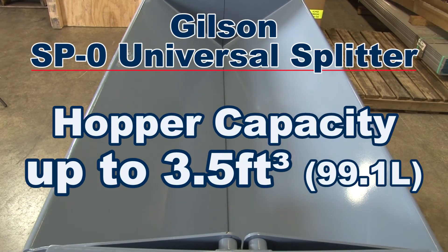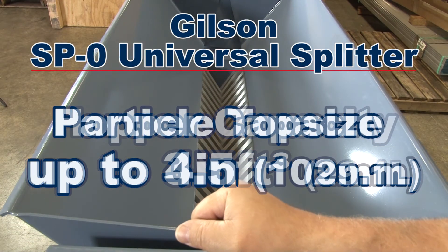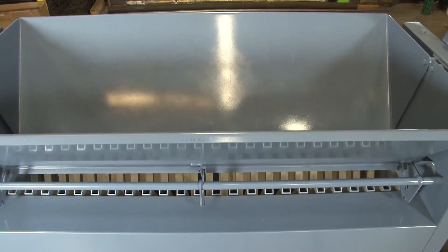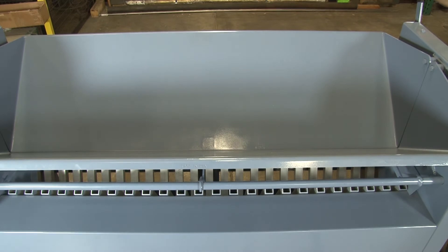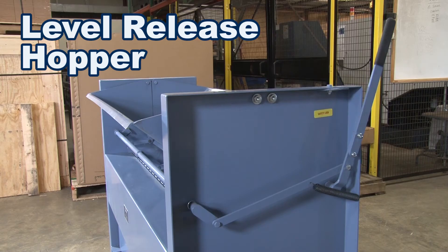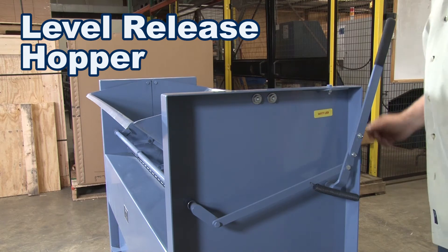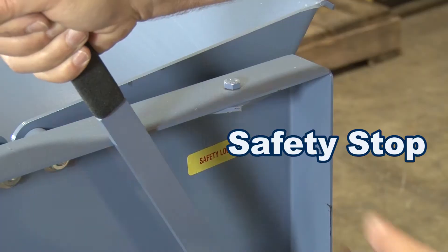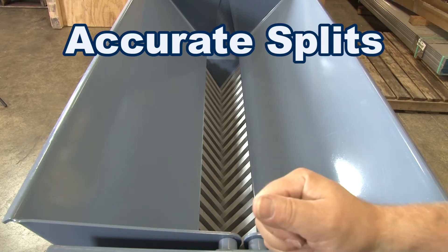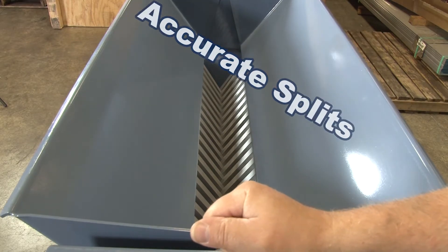Samples up to three and one-half cubic feet with a particle top size to four inches are accurately and quickly divided with a minimum of handling. The lever release hopper of the universal splitter remains closed until the bulk sample has been fully loaded and evenly distributed, ensuring uniform distribution of material through the chutes for more accurate splits.